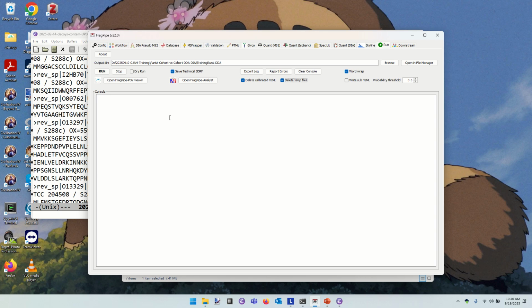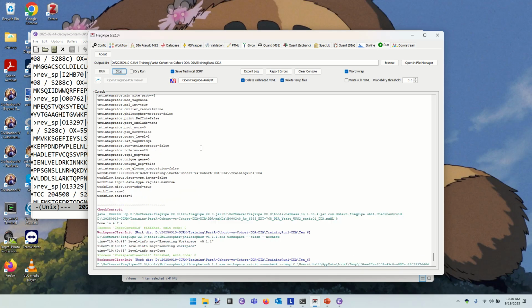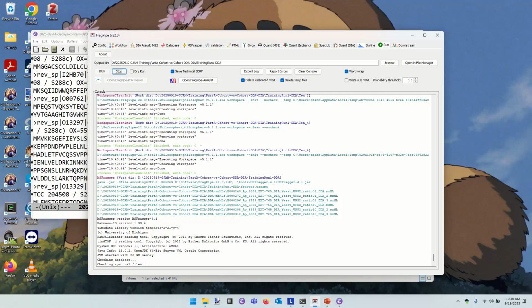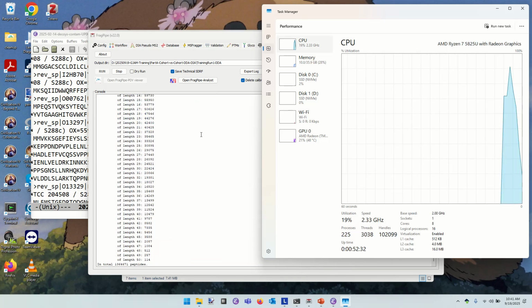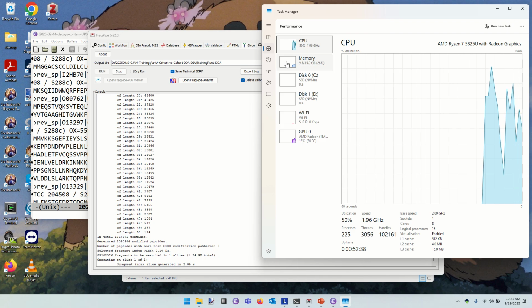It is that way. All right, so I'm going to hit the run button and see what happens. Now, ideally, you're getting a whole spray of text showing up on screen as the software starts working its way through the problem. I often like to see what kind of load this is putting on my system. I'm going to come down here to the taskbar, right-click, and say Task Manager, because it's useful for that. Then I can click here.